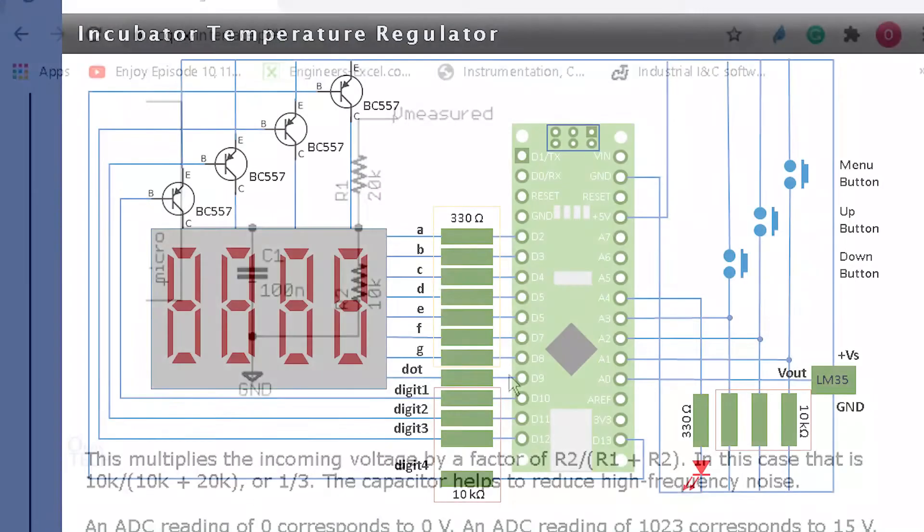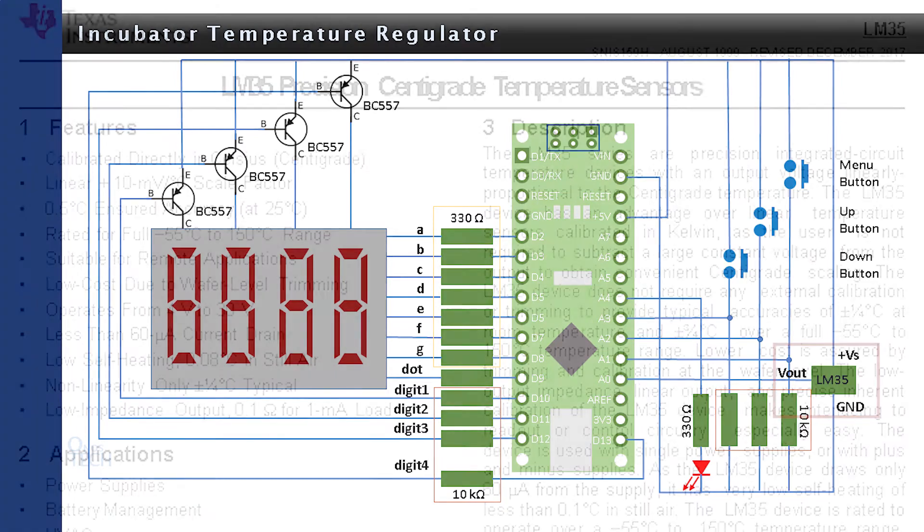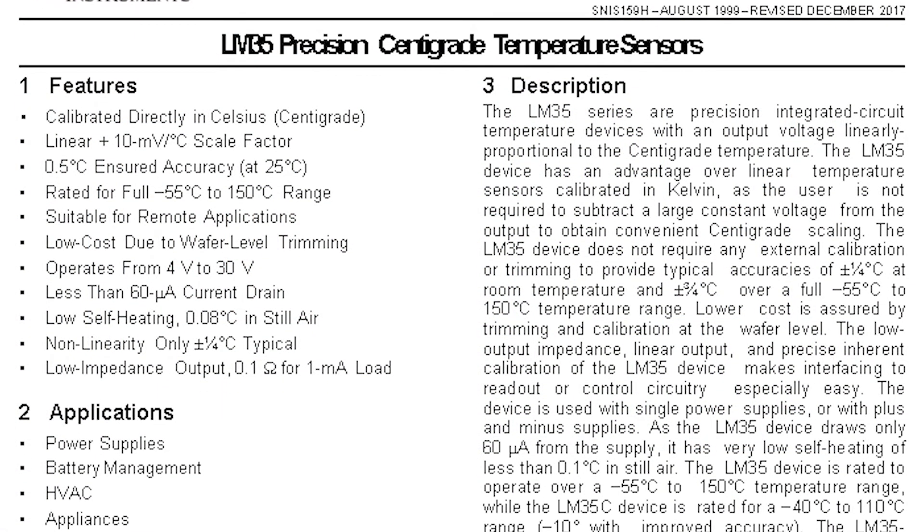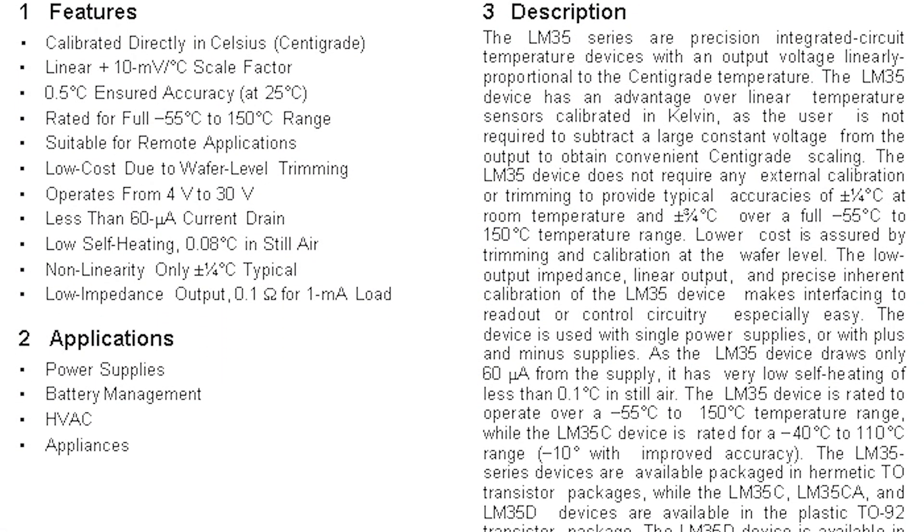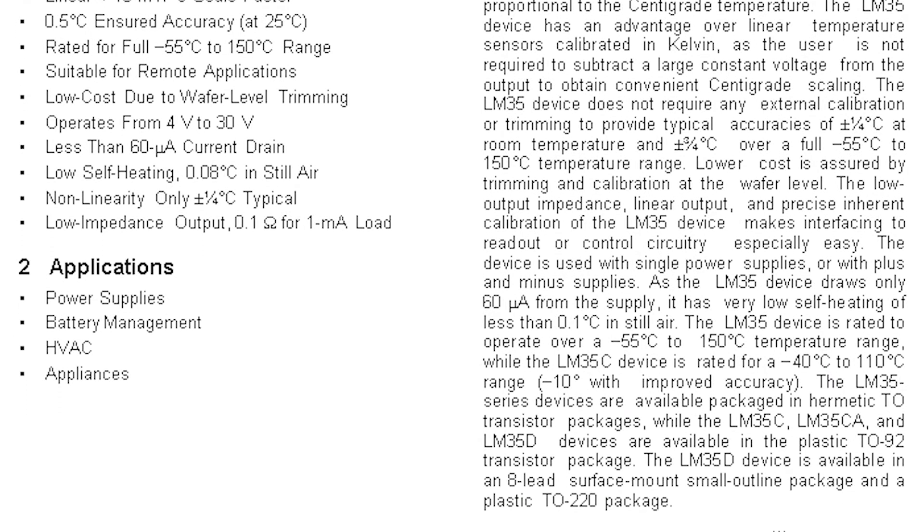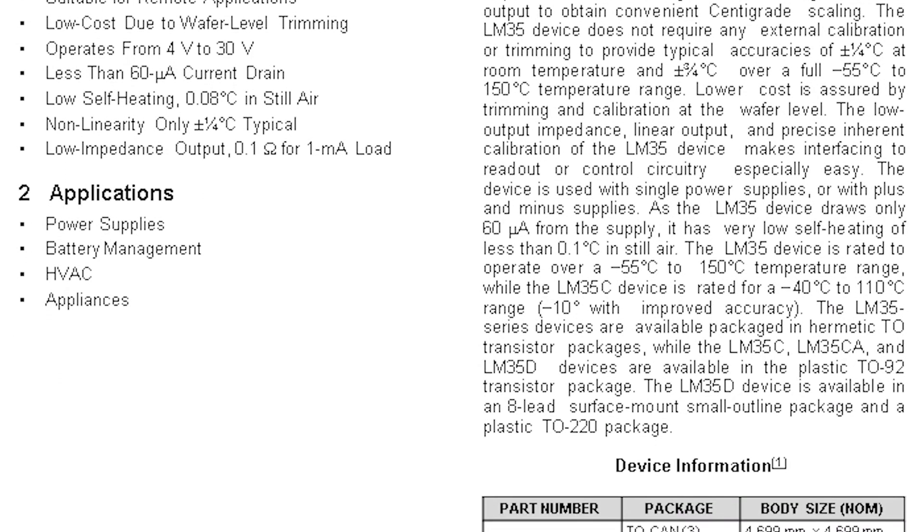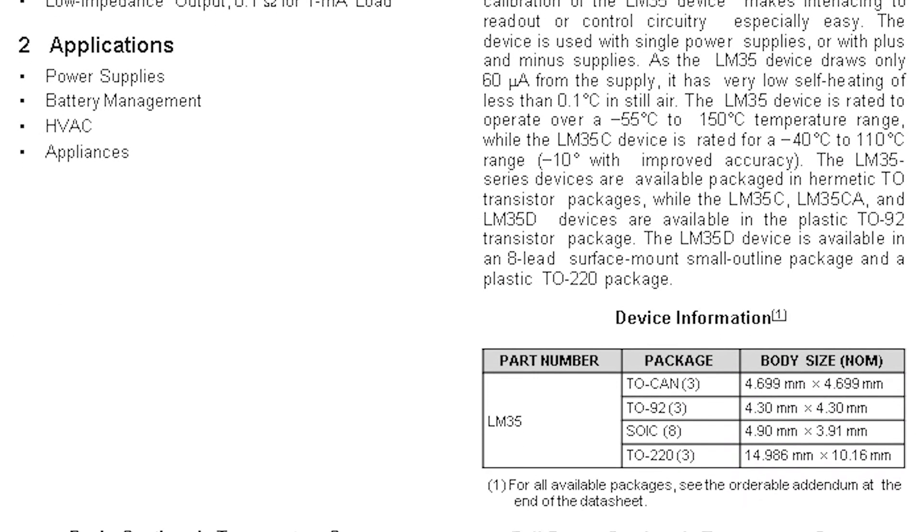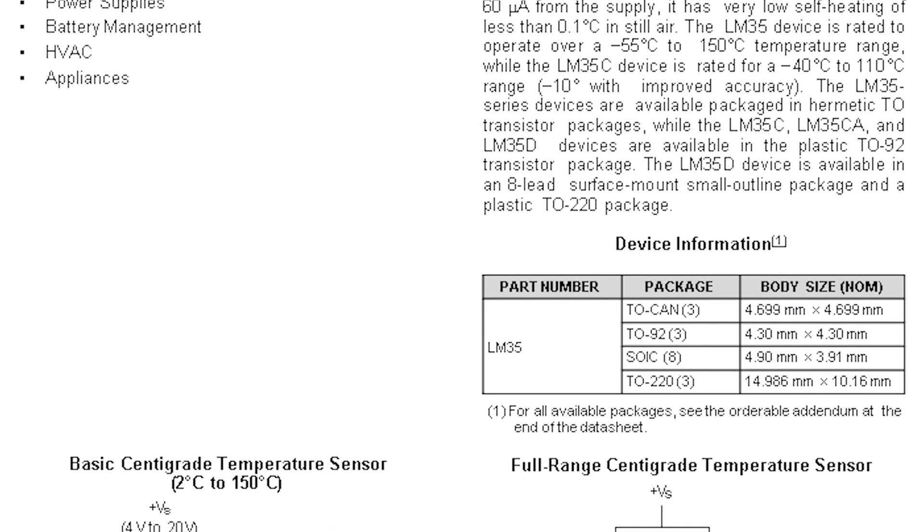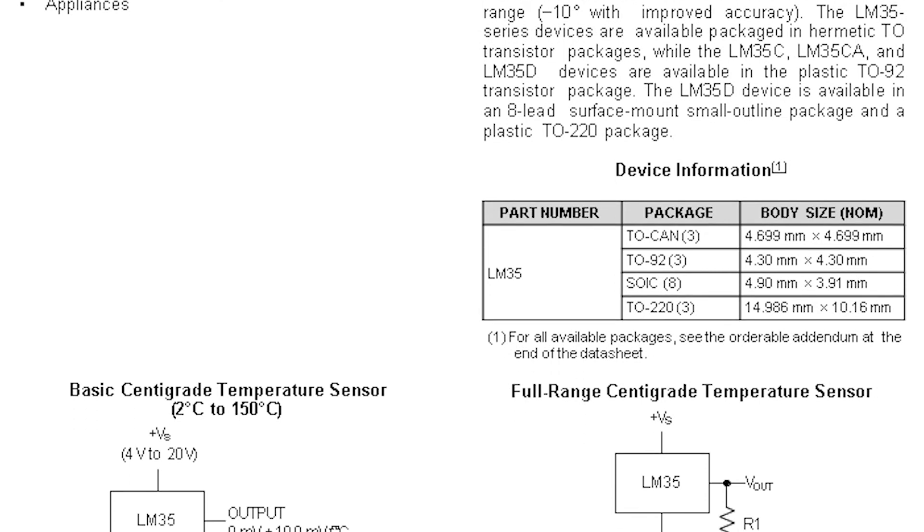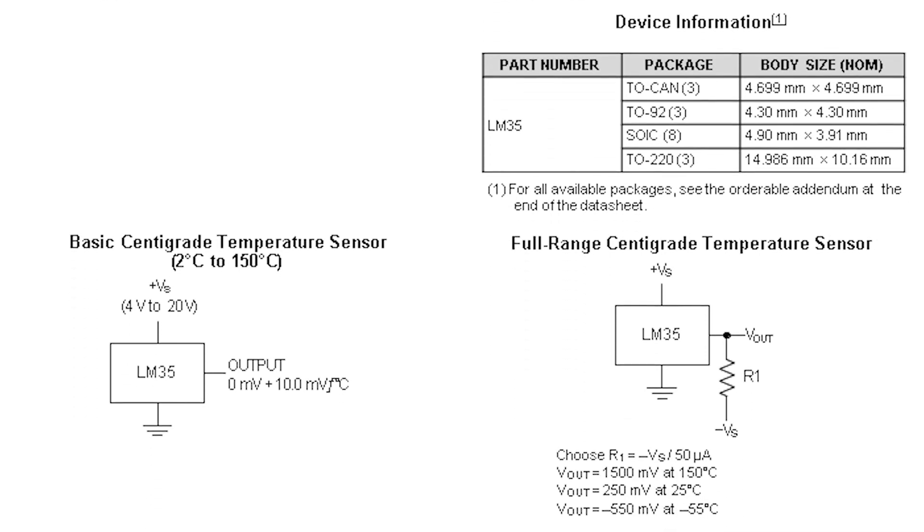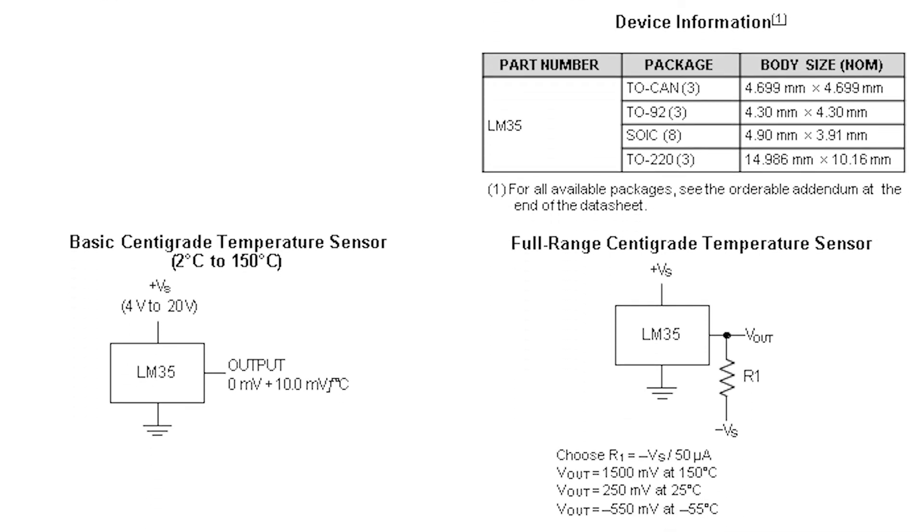Finally, let us create the incubator temperature regulator. First, replace the potentiometer in the previous circuit diagram with the LM35 temperature sensor as shown. The LM35 sensor measures temperature in centigrade and produces a voltage output of 10 millivolt per centigrade. It can measure temperature ranging from 2 degrees Celsius to 150 degrees Celsius.